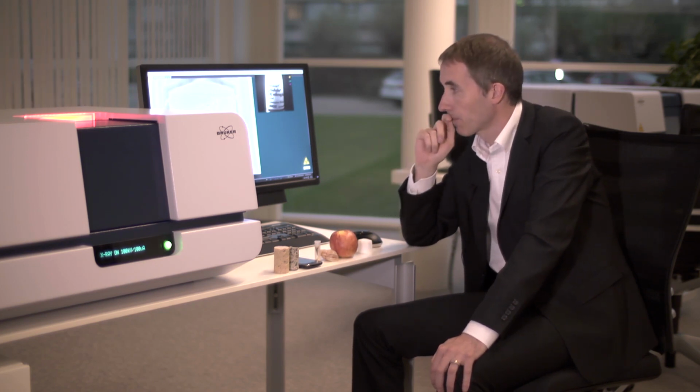Optional for this scanner is that it can also come with a range of additional stages. These stages can include for mechanical properties like compression or tension, where you can place in the sample, and at different loads or at different displacements you can scan repetitively. An alternative different stage that you can use is a heating or a cooling stage, where again the sample can be heated or cooled to the desired temperature and then scanned at that temperature.